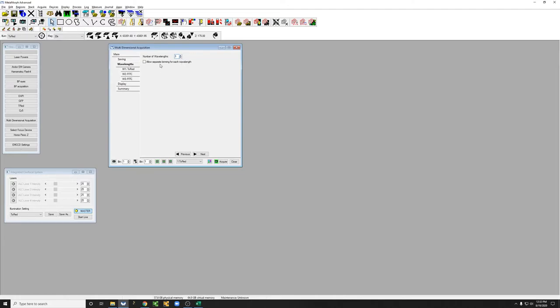I'm going to leave Allow Separate Binning for Each Wavelength unclicked. I'll explain what that is later when I go into binning, but for now just leave that alone.